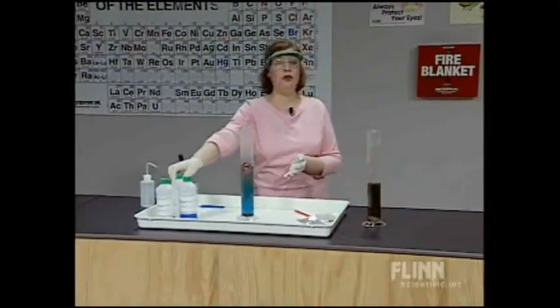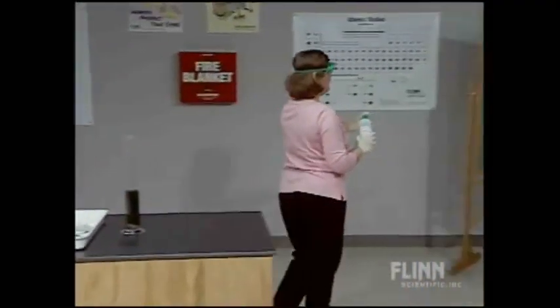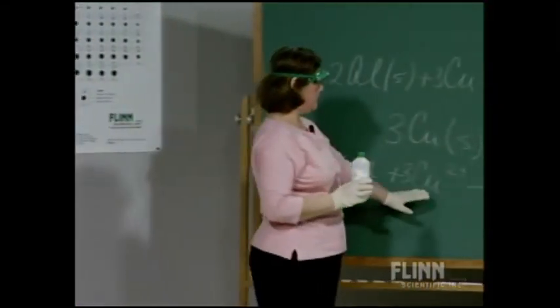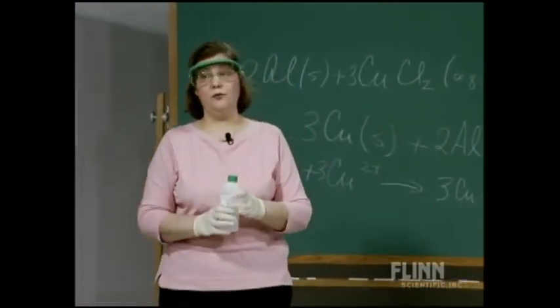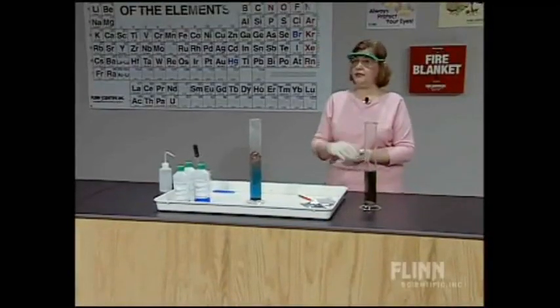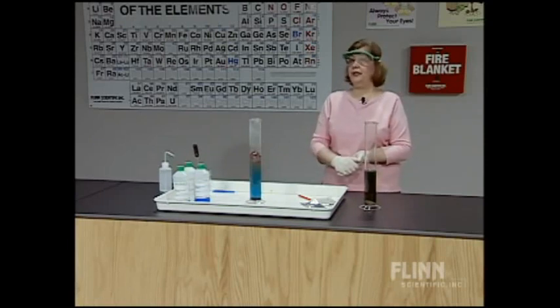One other topic or concept that is a part of this demonstration had to do with the role of the chloride ion, because we said that the chloride ion didn't appear to be involved in the overall chemical reaction based on the net ionic equation, but yet the chloride ion was necessary for the reaction to occur. It made it go faster in the case of the copper sulfate. And we can't prove it, but we have reason to believe that that chloride ion is still there. And you could actually do some tests to show that. So a substance or a chemical that increases the rate of a chemical reaction, but that isn't used up in the reaction is called a catalyst.